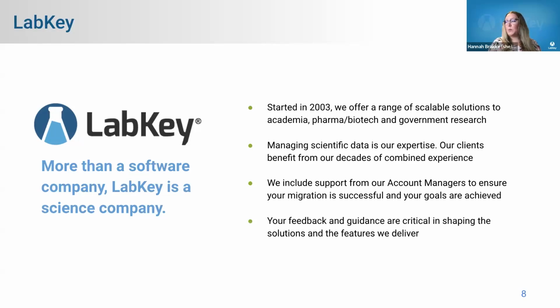Okay, great. One more question here is, what are the traditional implementation times for LIMS these days? I can only speak to what I know. The traditional LIMS I know are months long. LabKey and some other modern LIMS that we've heard of is more on a days to weeks basis, right? We're talking about 6 to 8 weeks. In a lot of cases, people can get up and running and start to utilize their solutions within the lab.